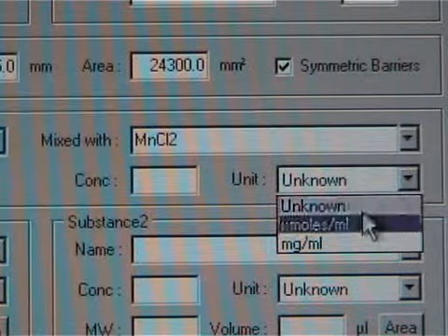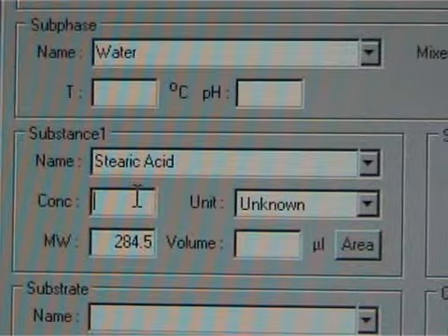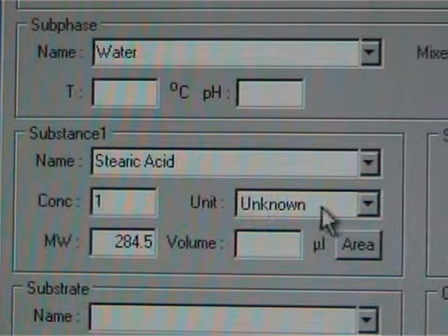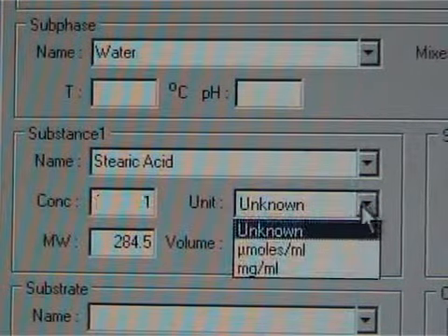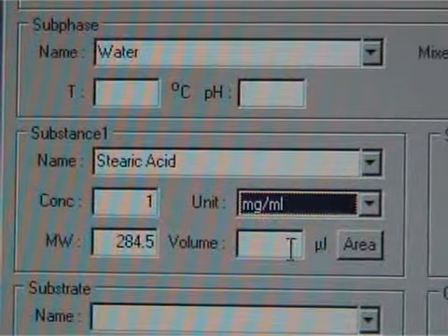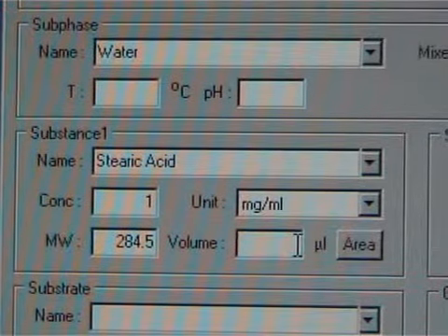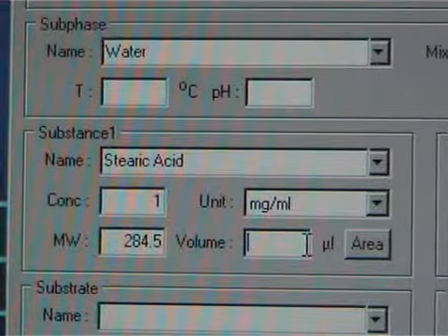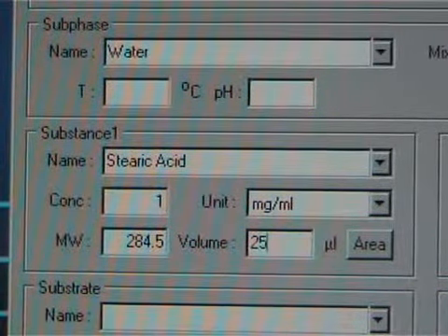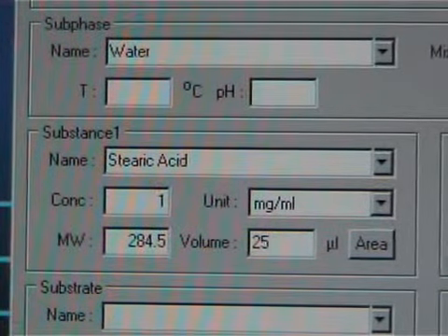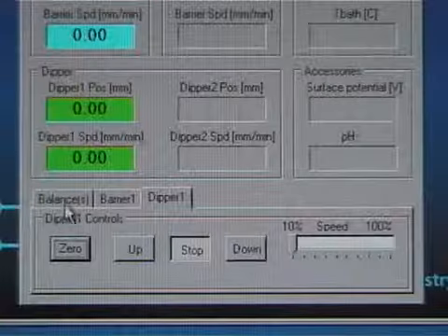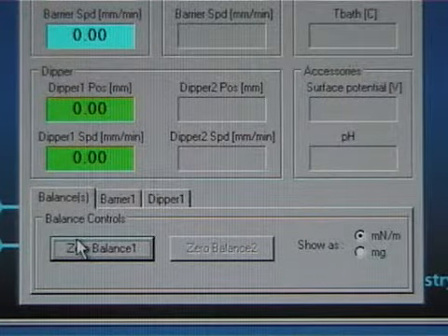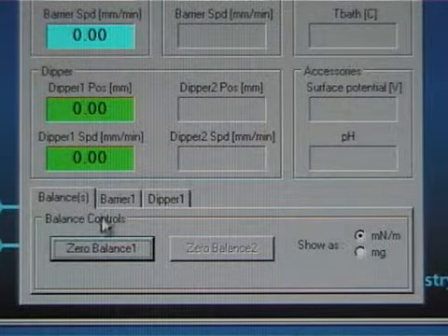Then select substance or type it in manually if you haven't added it to the database yet. Insert the concentrations and choose the unit. After making the isotherm measurements, the desired measurement conditions should be known. Choose the manual control unit window and zero the balance.